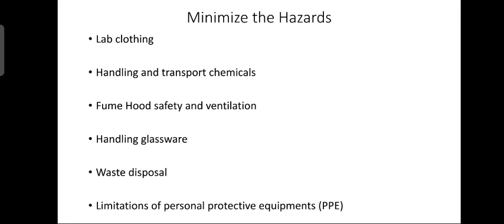Now, let us see what waste disposal is and how to do it. Ensure proper segregation, containment and storage of waste. Miscellaneous and other contaminated solid waste such as papers, cottons, gloves, etc. Disposable plastic chemical containers should be collected separately. Sharp objects like broken glass pieces should be separately collected in appropriate containers.